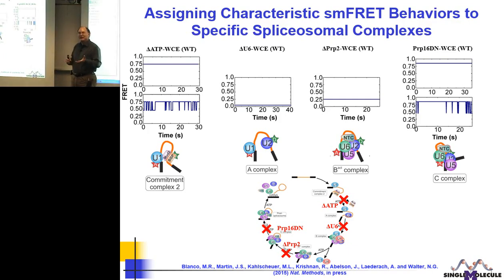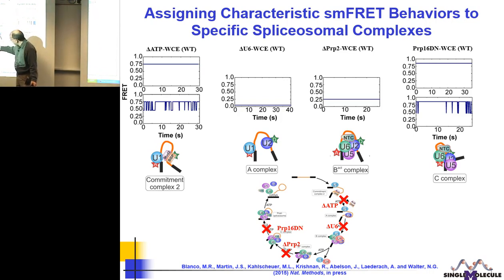And so in a way, we are doing bioinformatic purification, right? We've also done biochemical purification, where we actually isolate individual complexes and then interrogate them specifically. But this is nice because you can look at everything, right? And so do your clusters or states reflect that model? They are consistent with that model. We have also done some work that's now under review and revision, where we have a lot of these actually isolated and can look at them individually, and it's very consistent.